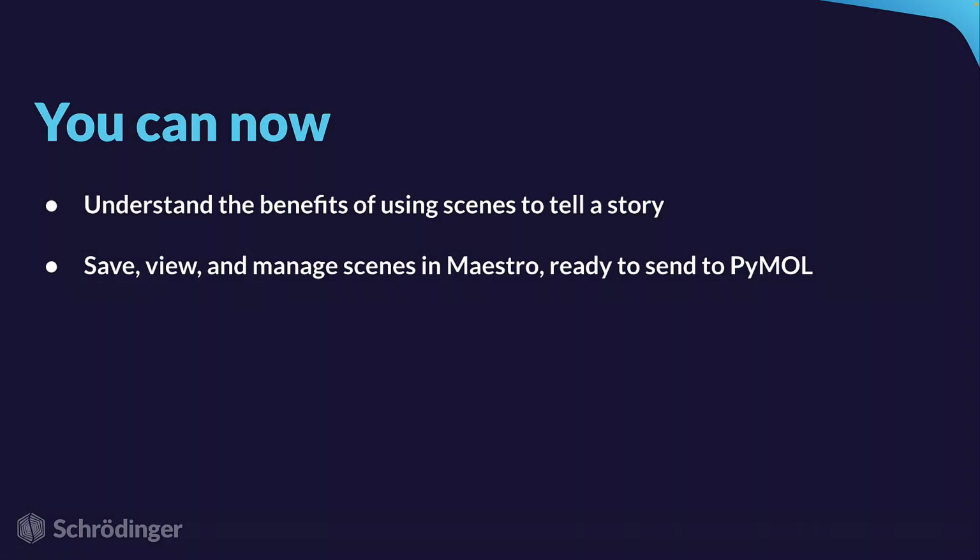That brings us to the end of this tutorial. You can now understand the benefits of using scenes to tell a story and save, view and manage scenes in Maestro ready to send to PyMol.